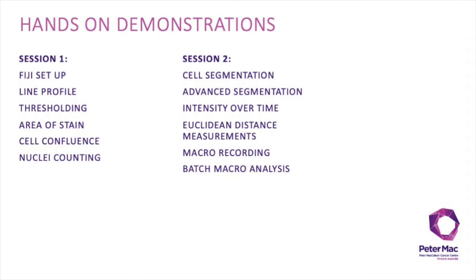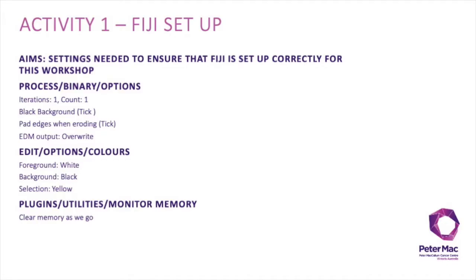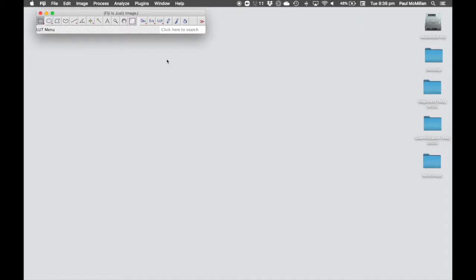In session 1 of the FIJI for Quantification workshop, we will cover demonstrations on FIJI setup. Activity 1 will ensure that we've got FIJI set up correctly for this workshop.